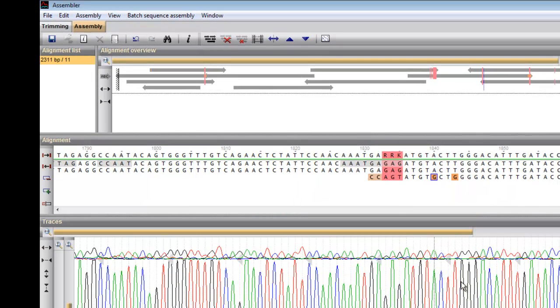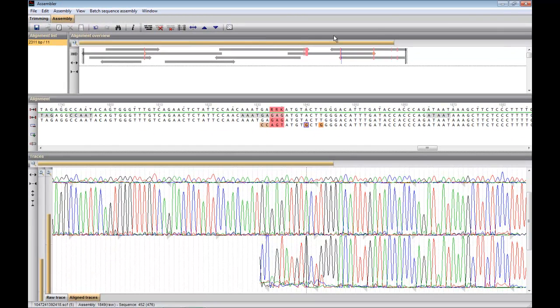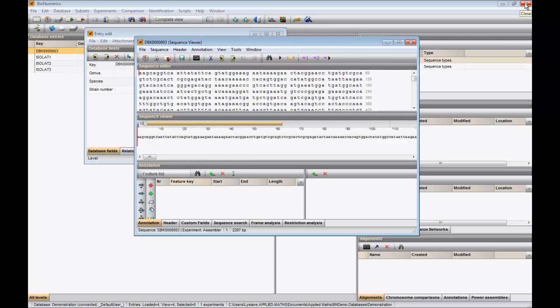When I press the save button and close the project, the consensus sequence is saved in the underlying sequence viewer window.